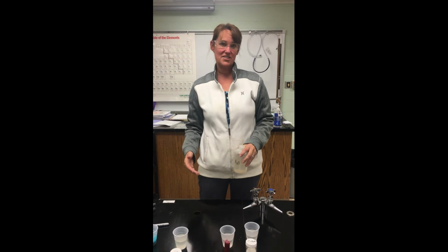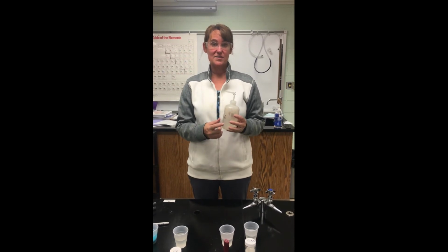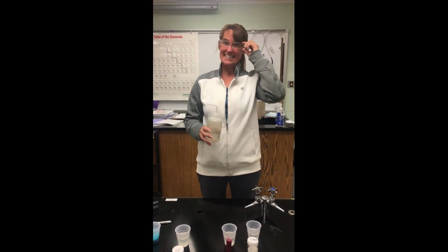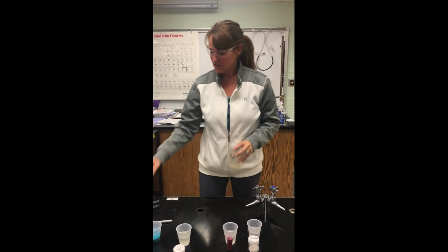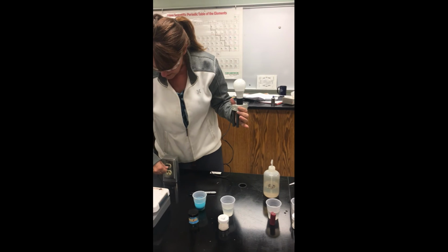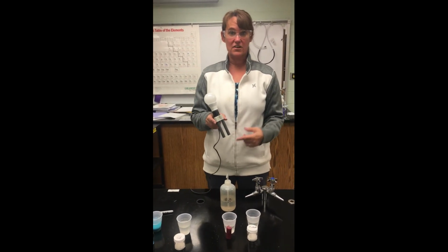So now we're going to check the conductivity, and remember, ionics break apart into ions, so they conduct electricity. Now we're using deionized water, so it won't affect the water that we're dissolving it in, won't affect anything going on. Also, I have my safety glasses on and my hair tied up. These are lab safety procedures. So here is my light, and at the bottom, it's not connected, so there's no way to get the current from one side to another, so it won't flow. However, if there's ions in solution, it will finish the current and the light will light up.